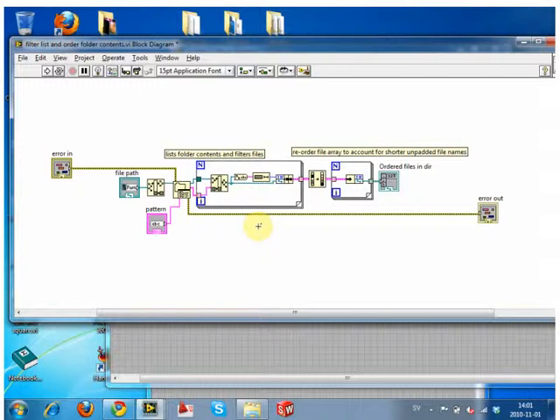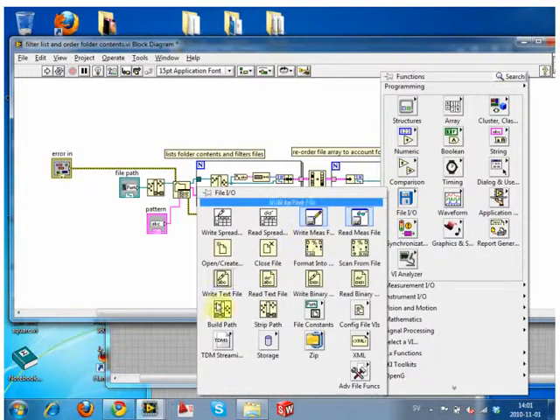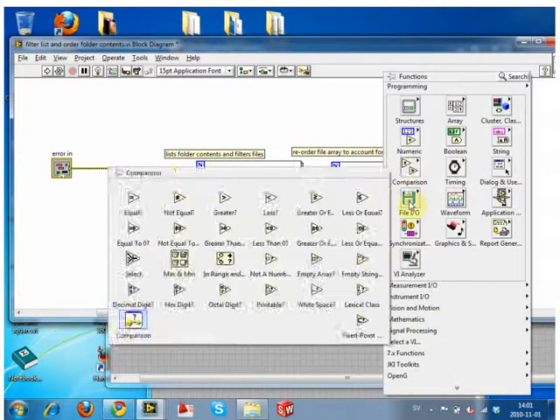And if there's a particular example, I can show you how you would do that. In this scenario, where you would do it would be here. The first section is creating the order, adding the extra features, sorting it, and then here is where we've actually pulled out file number 1. So instead of reading this, essentially what we would do is go to the file input output, and then strip the path off this file. Okay, and then right next to it, we would build the path.